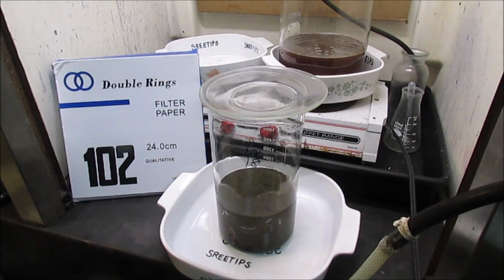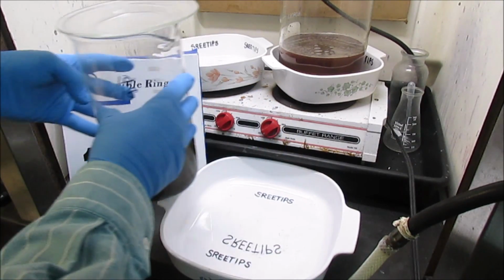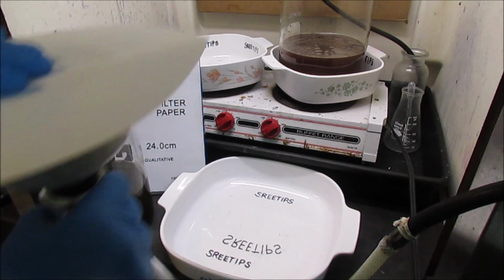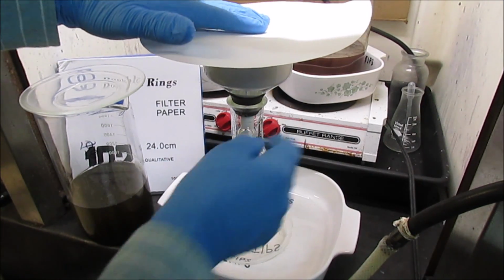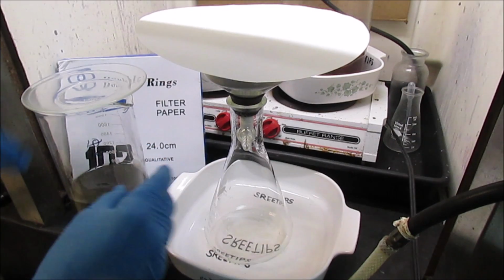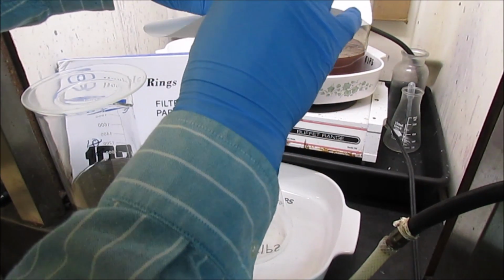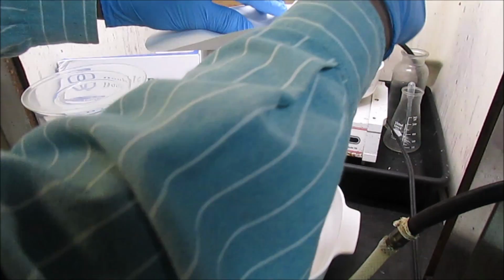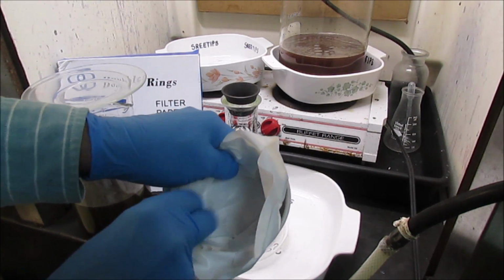I'm going to try an extra large filter here so we can catch all the gold. This has been settling now for a couple hours and it's taken a long time to settle. So I'm going to try to fashion a filter here that will catch all the metal for us. Kind of wad it down in there.